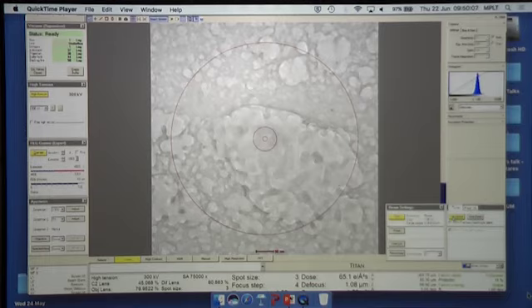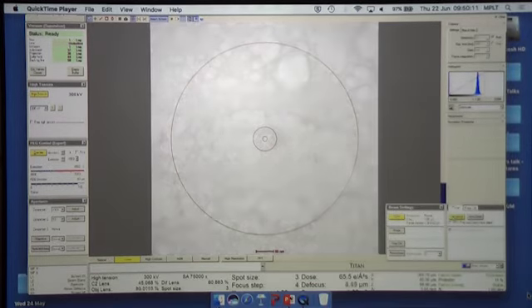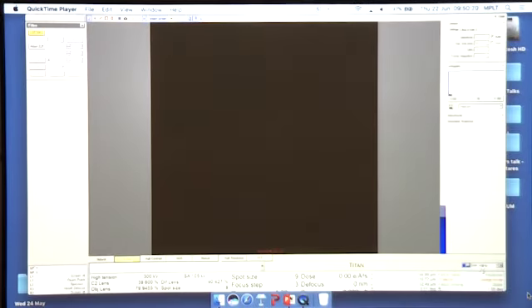Same thing now, doing it on the flu screen in TEM mode. So here you don't need an FFT, you can go by the fringes in your image. So you can see the fringes from over focus and go back until you lose these fringes, then you're in focus. We're back in FTEM mode now.